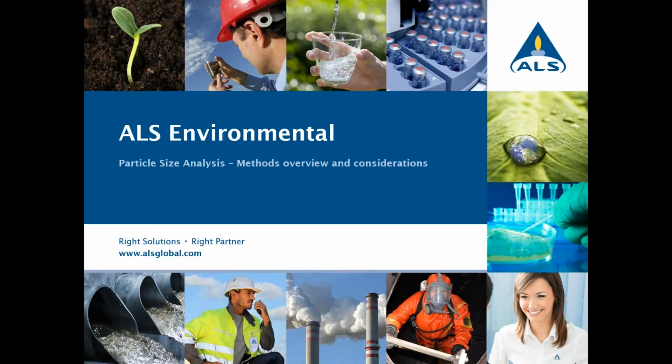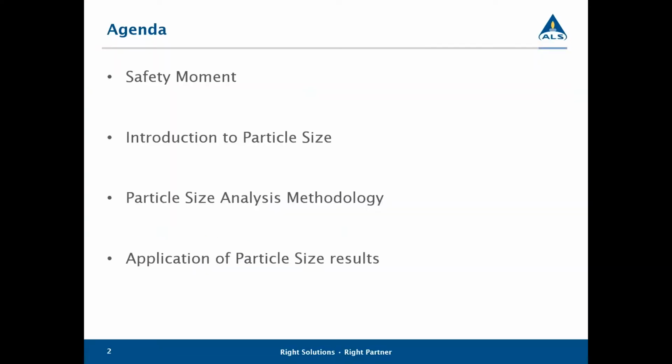Thank you, Kelly. So as Kelly said, I'm here to speak about particle size analysis. And today we're going to be focusing more on the analytical side of things, as well as the application of the particle size analysis. To start today off, we're going to start off with the safety moment, which is just how ALS likes to start all their presentations, followed by an introduction to particle size. What does particle size mean, and how do we go about it? Followed then by methodology for particle size analysis, because like a lot of different methods, there's different ways of doing things based off of the particle sizes and the particles in question. And then finally, we'll go into some of the applications of particle size analysis results.